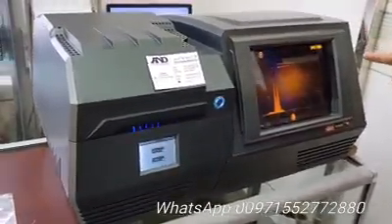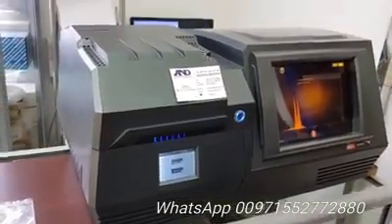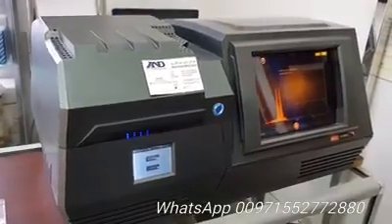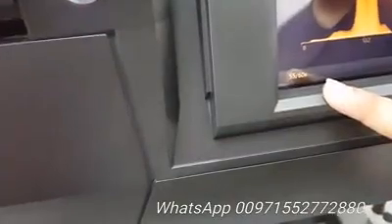You can also connect a printer, keyboard, and mouse. It takes only 1 minute to test — it's almost over.